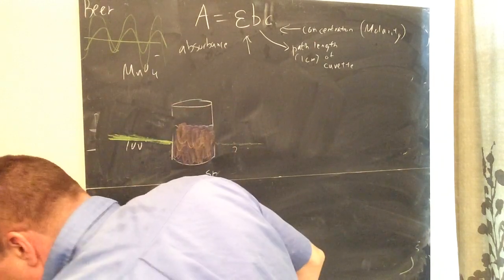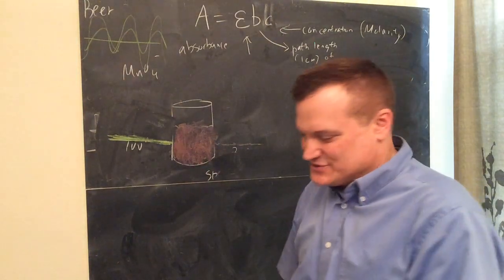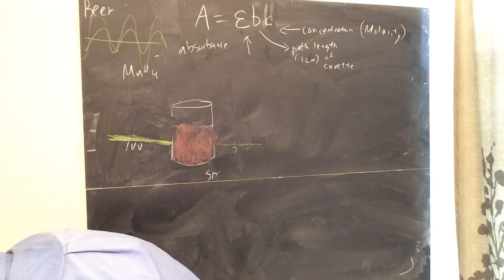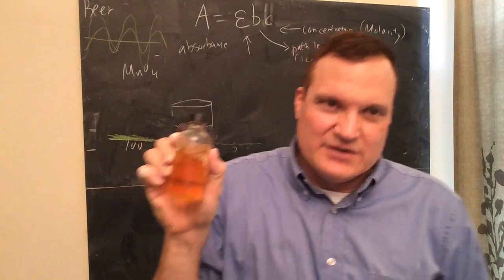Kind of an orange and a red color. So hopefully, yeah, that looks reddish-orange now because this has iron in it. So this experiment, if we were able to do it in person, we actually use, okay, let me tell you how it works. I actually have both of these to show you. We actually use iron solution.